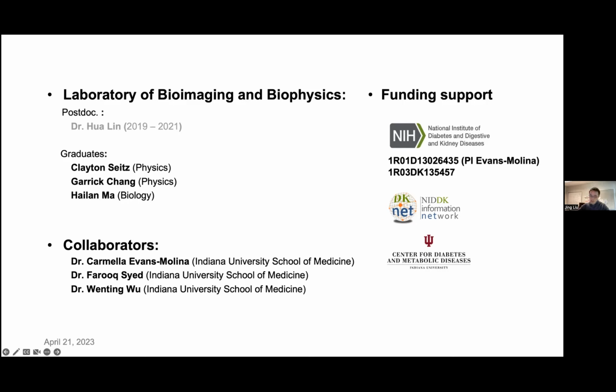So we used a wide field channel, because we are collecting the three-dimensional stack of the images. In other words, when the imaging depth is changing from the top to the bottom, typically you get a DIC-based image, and we do some deconvolution approach where we can turn the depth contrast into a kind of fake fluorescence channel. This is called volume contrast image, which is quite useful, and it's a standard feature in the Nikon imaging software.